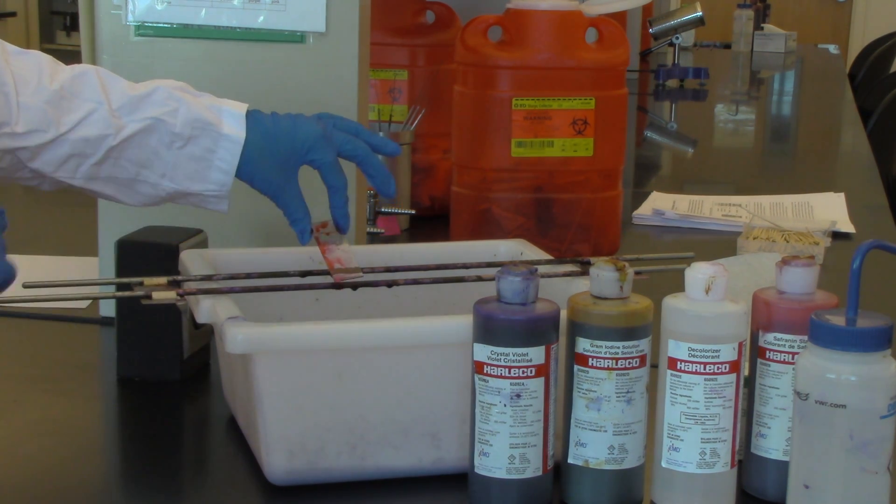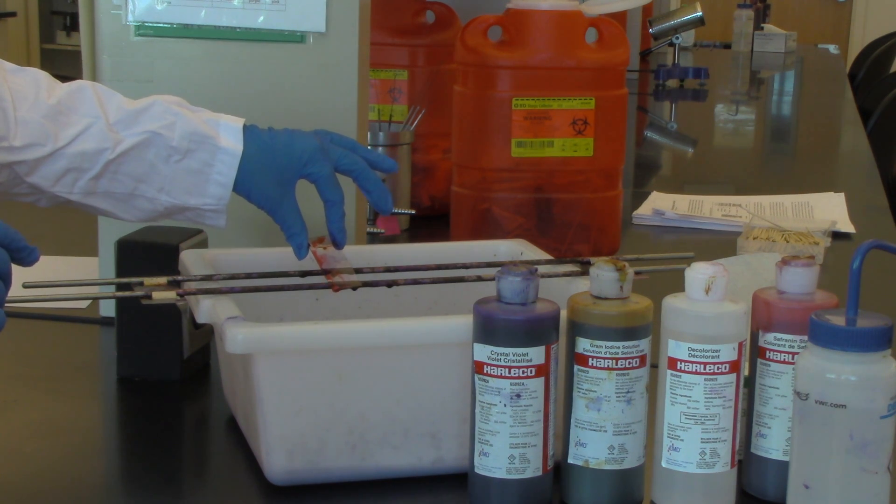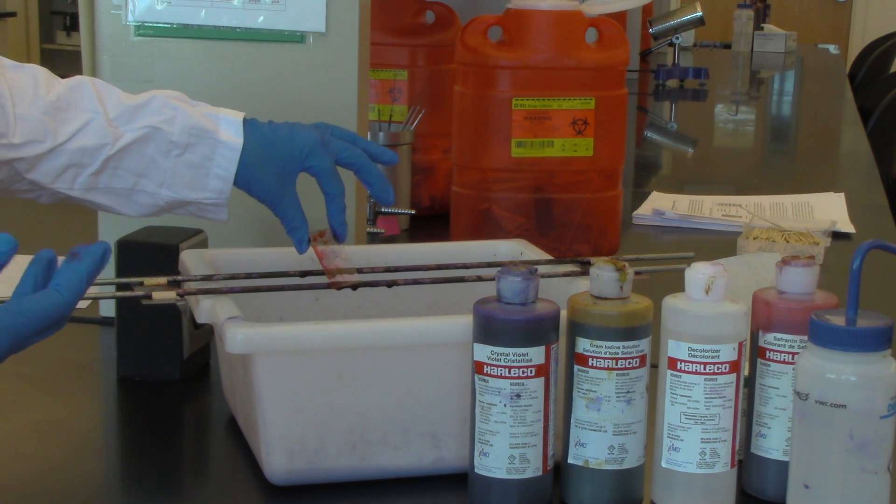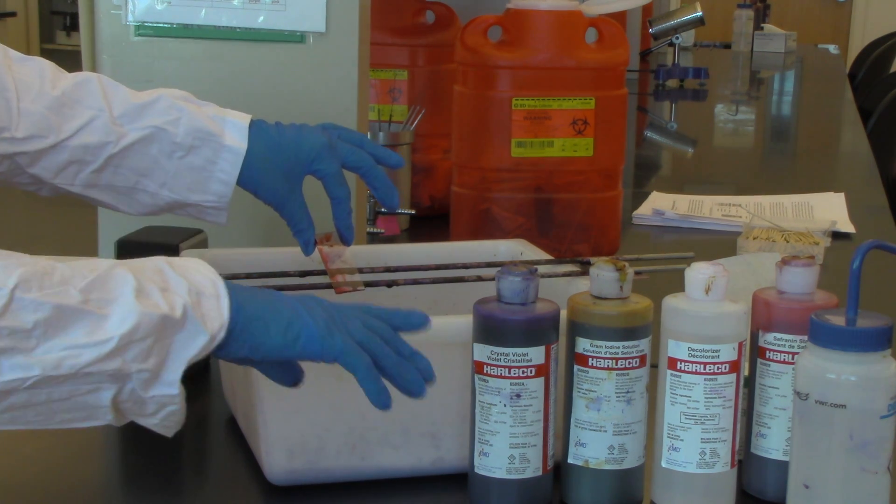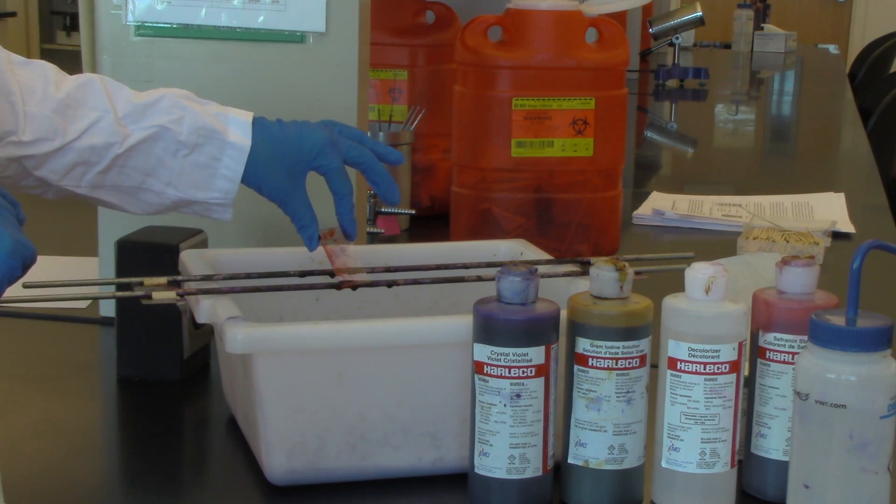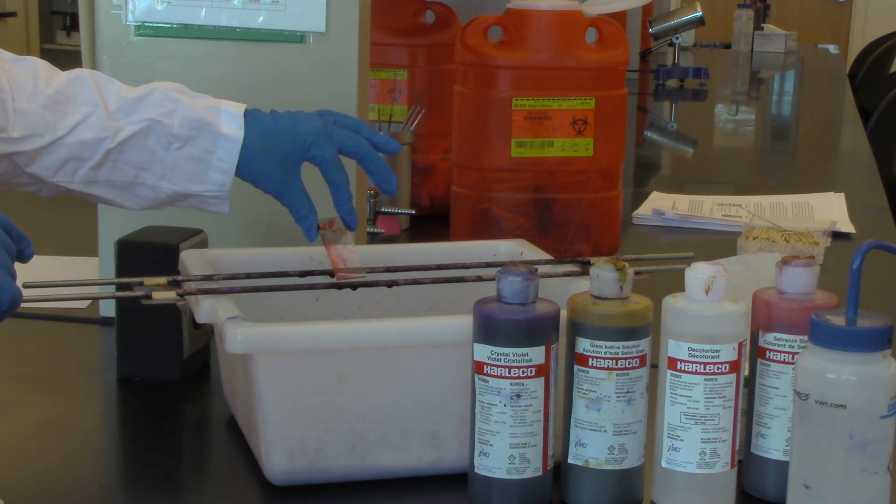But when you go to that decolorizing step it basically degrades and breaks down that gram-negative wall and the crystal violet will wash right back out. So you need to do that last step with the safranin to pick up the gram-negative, and that is the gram stain.